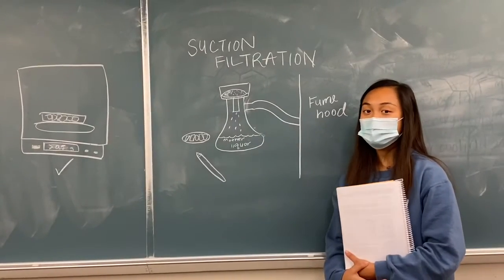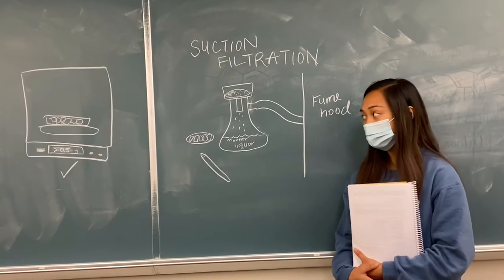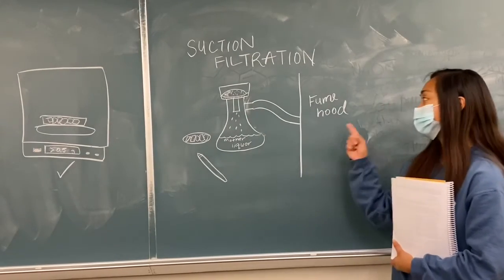Once the experiment is finished, make sure to clean your station properly, dispose of everything properly, and clean up all the used materials part of the lab, also to turn off the fume hood.